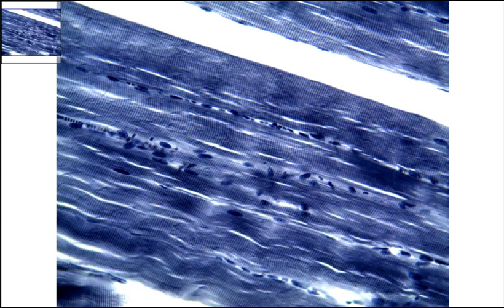Now the current magnification for this slide is 400x total magnification. What we're looking for are the distinguishing features of this skeletal muscle from any other muscle slide. One thing you're hopefully noticing is we have these long cells stretching across the field of view.